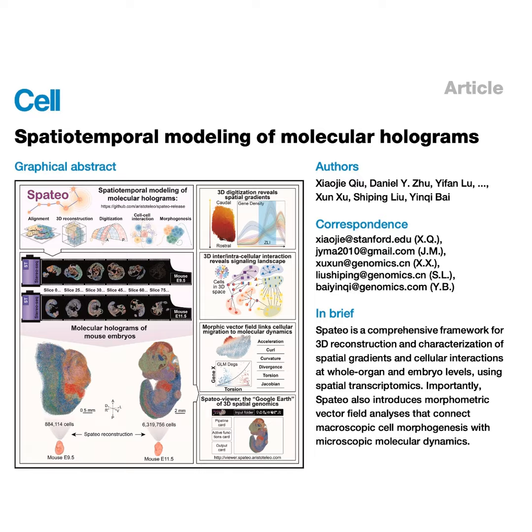Oh, totally. The knife squishes the cells, the tissue stretches, it tears, and it warps as it's mounted on the slide. So it's literally like trying to perfectly reassemble a sliced loaf of bread where the slices have been squished or torn. If you simply tell a computer program to stack slice number 2 on top of slice number 1, nothing is going to line up. Right, the biological landmarks just won't align. A developing blood vessel in one slice might be physically distorted 3 millimeters to the left compared to where it should be. So I'm guessing standard image alignment software just completely falls apart here.